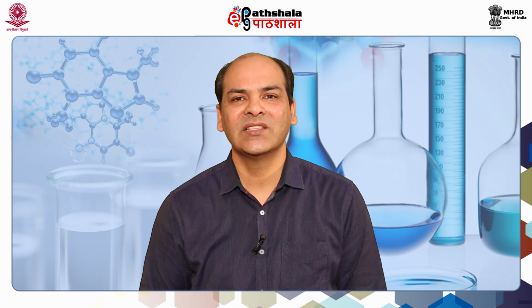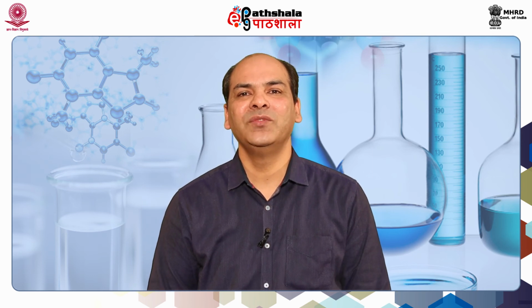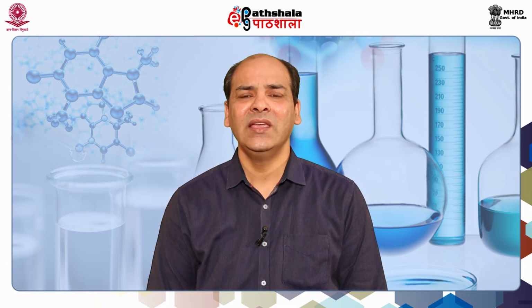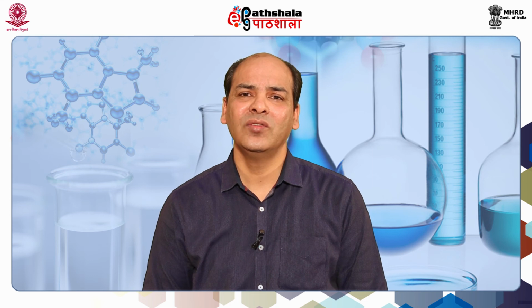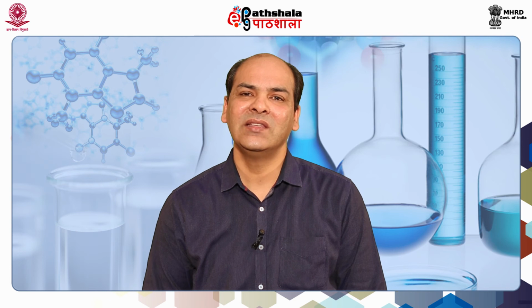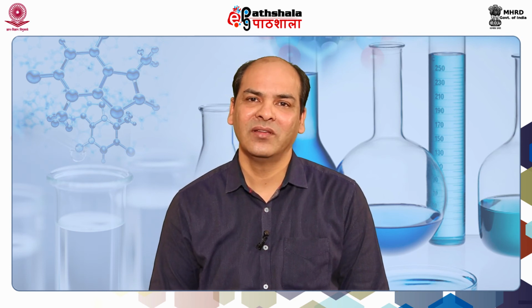Why do we say that they are symmetric? Because if you take a mirror image of these objects and try to superimpose it over the original object, in that case, if the two objects are not superimposable, then it is asymmetric. If they can be superimposed completely, then they are symmetric.